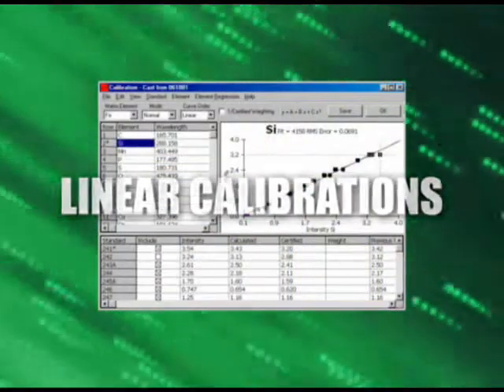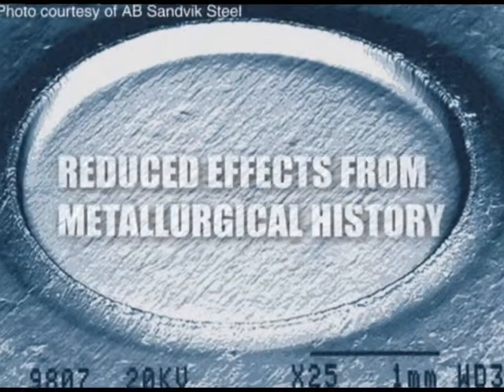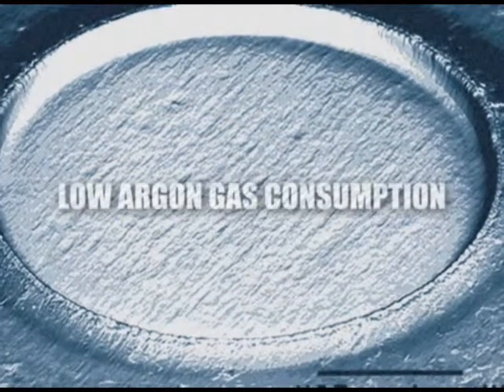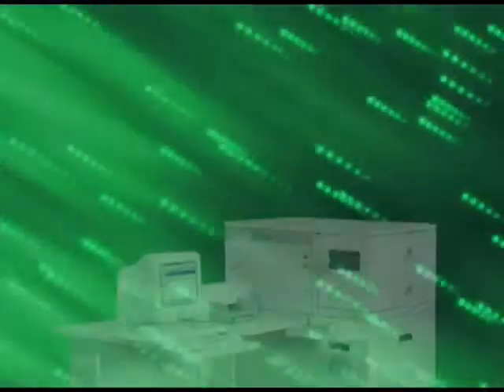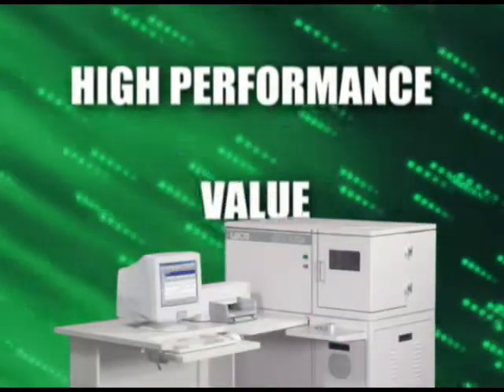Linear calibration using fewer standards, less complex spectra, reduced effects from metallurgical history, and low argon gas consumption. The Leco GDS500 is a rugged, cost-effective spectrometer for your laboratory.